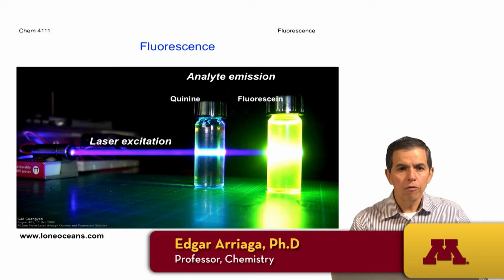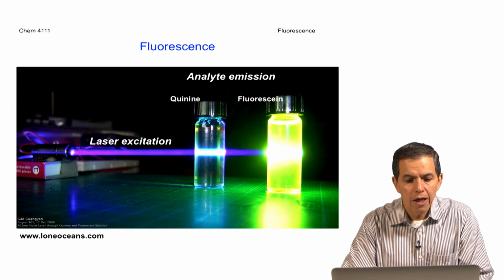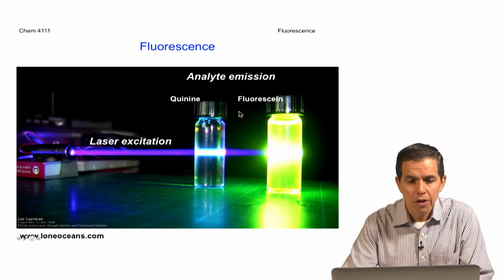This is an introduction to fluorescence spectroscopy. Fluorescence is a technique that uses light as a source for excitation of the analyte and detects emission of light from the analyte at a longer wavelength. In this particular slide, fluorescence is illustrated for two analytes, quinine and fluorescein.